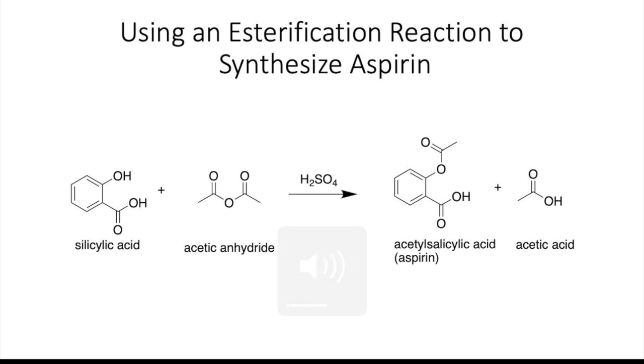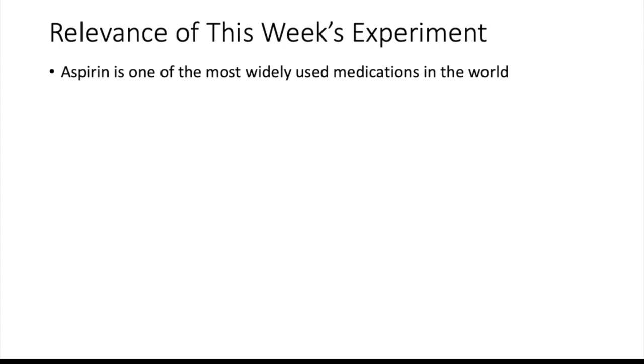Today we'll be going over the synthesis of aspirin through an esterification reaction. So a little bit about the relevance of this week's experiment. Aspirin is one of the most widely used medications throughout the world.